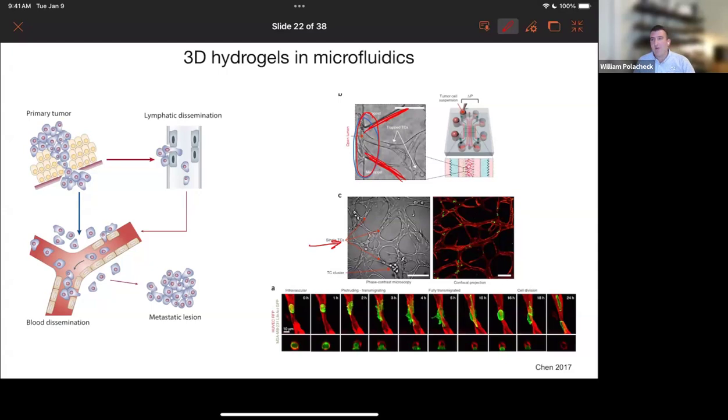If you're interested in using these for your own work and having trouble with the posts, feel free to reach out, because we sometimes use these posts because they work easily, but then we don't like to use them. We have to seed cells along that parent channel because of the stiffness gradients of PDMS.